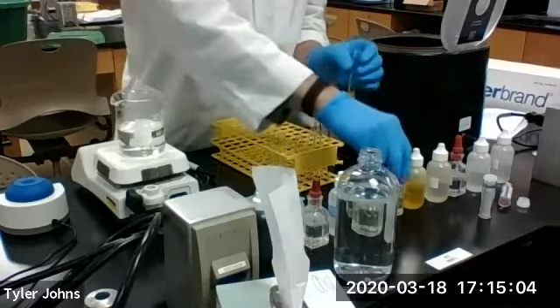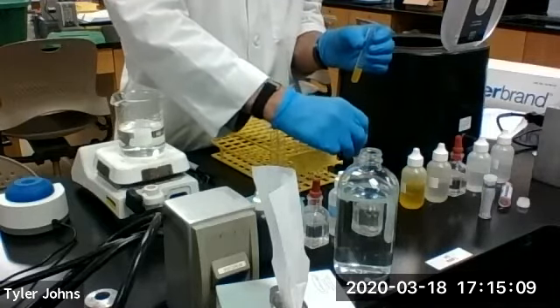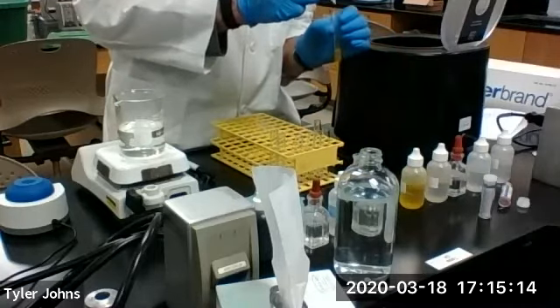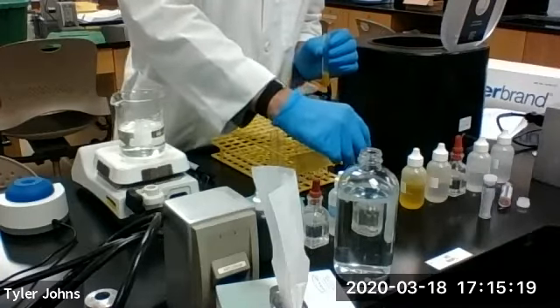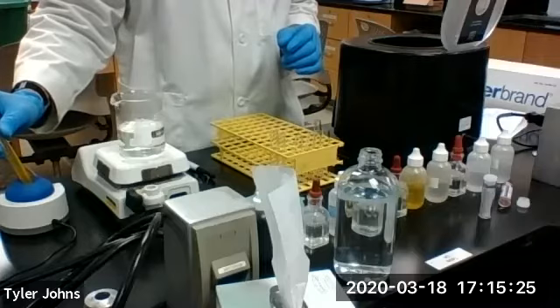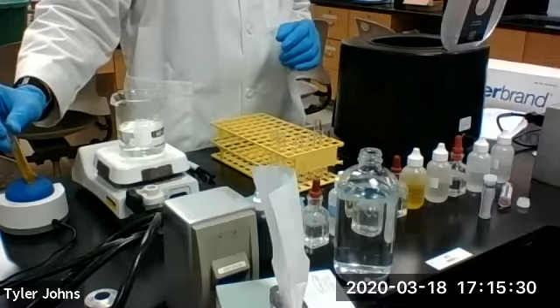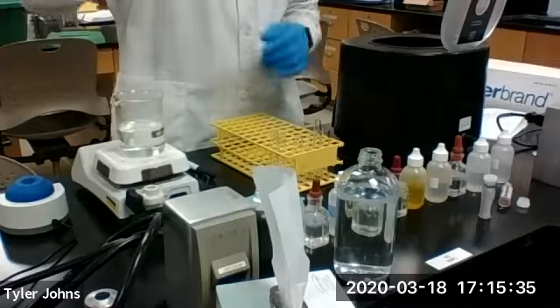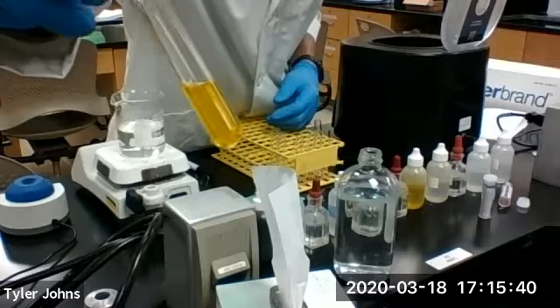We haven't quite dissolved the barium chromate, so we're going to add just one or two more drops of the 6 molar hydrochloric acid. As you can see, the barium chromate has now been dissolved with the 6 molar hydrochloric acid.